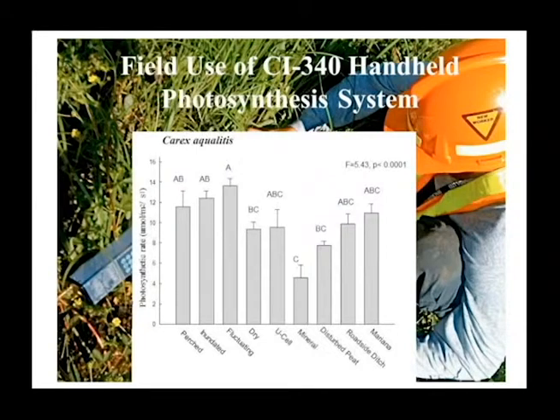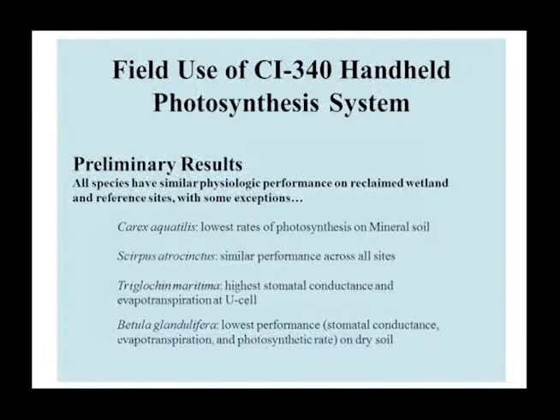And then, so I take all these data points during one growing season, and to make sure I'm getting an accurate assessment of those plants, I take about 30 readings. So each one of those bars is 30 readings with the handheld device and then averaged. Next slide.